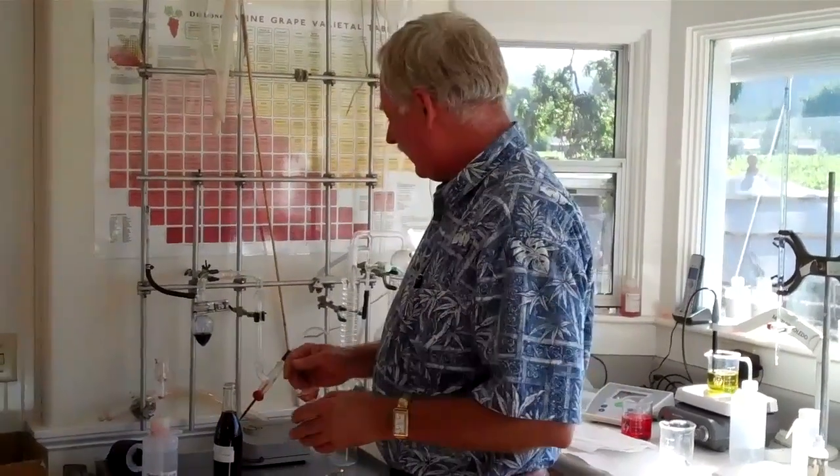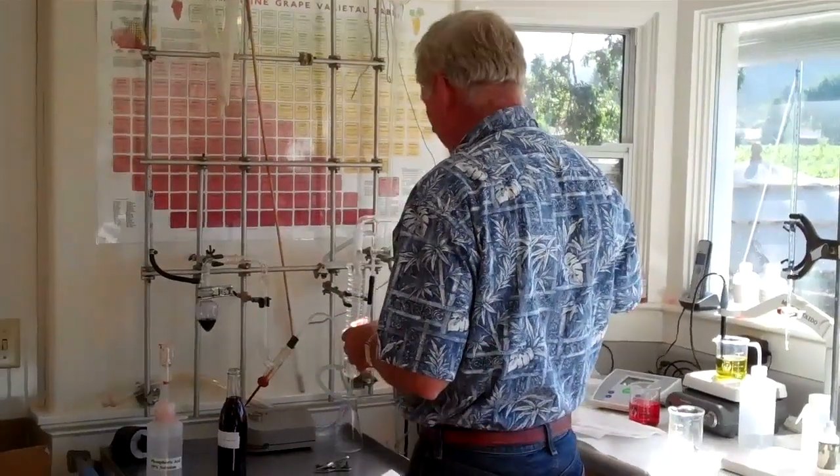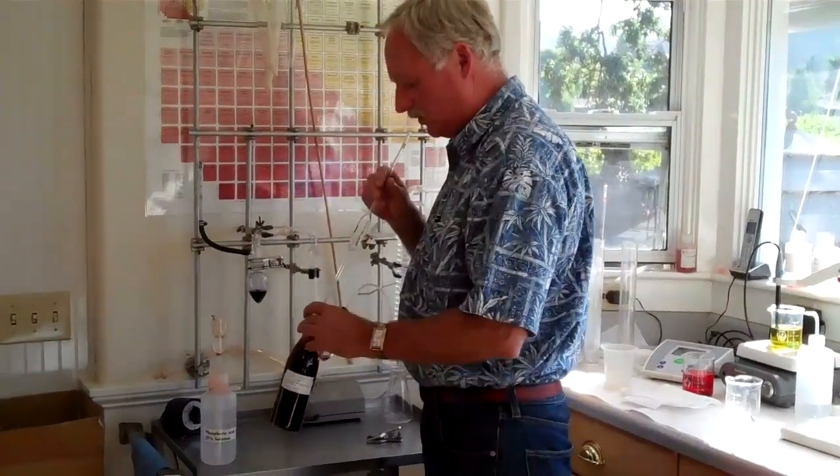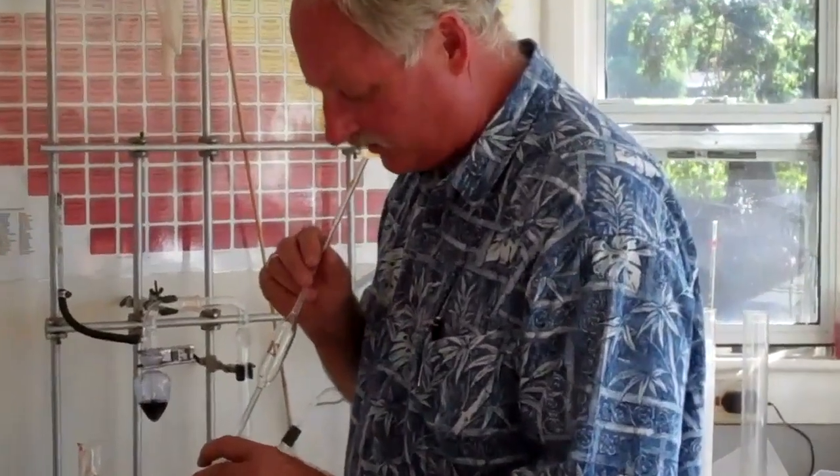The first test I do with the wine is free SO2, or sulfur, and I always want to do that test first because once I pull wine out of the sample bottle, the air in it will diminish the sulfur or make it lower. So the first and most important test is doing the free SO2.